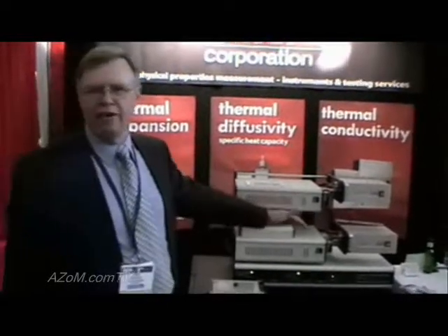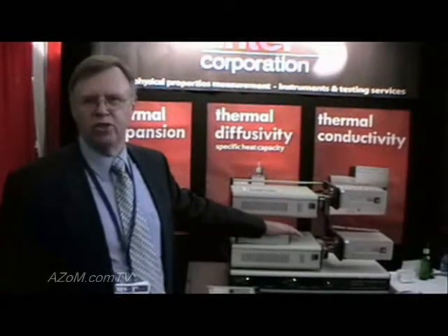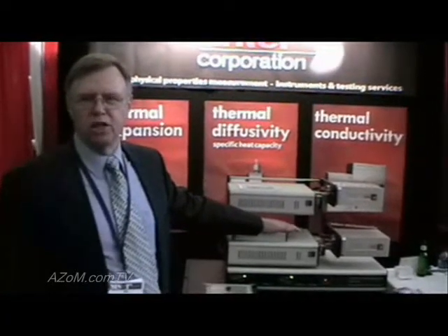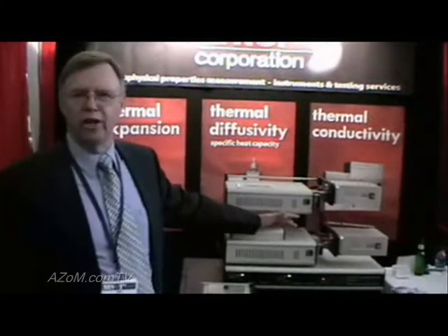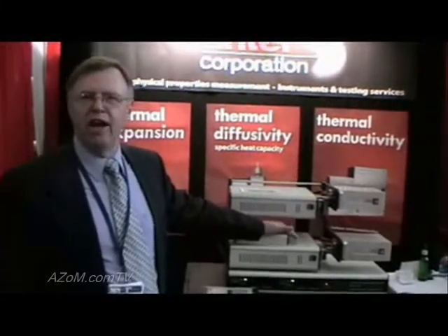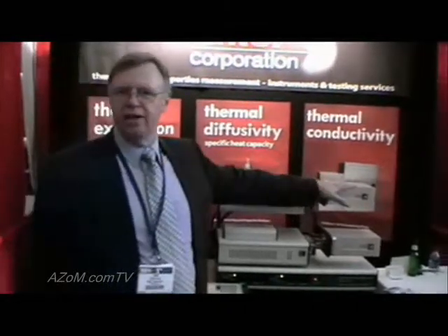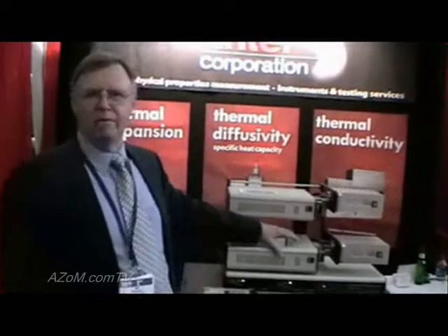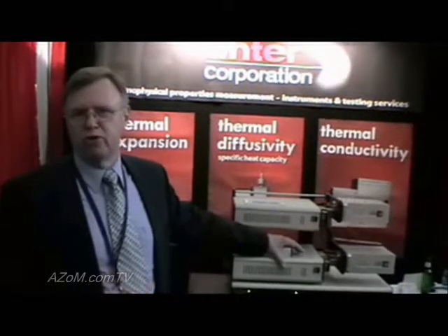All of our technology is digital — we use absolute digital displacement transducers instead of the old-fashioned analog LVDT type. We've been using these for over 20 years. So we have very accurate, very linear measurements with no drift of temperature and no need to control the temperature head. We have very accurate measurements plus a wide range of expansion, with a travel range of up to 25 millimeters.